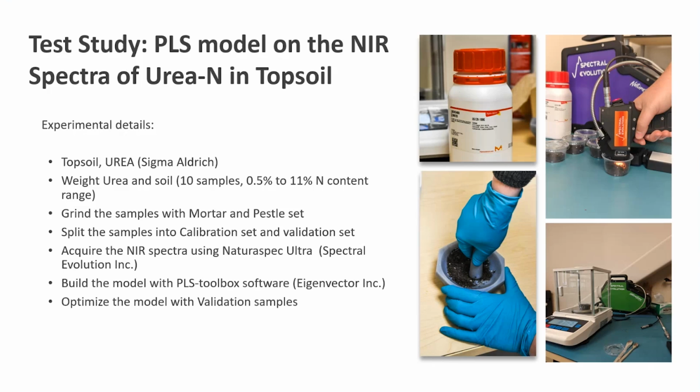So this is a rudimentary, very straightforward way of building a nitrogen model. There are some more complicated ways of doing this, but this is probably the most common way to do it. And we only used 10 samples, but for a robust analysis, you should be using about 100, or a lot more than 10 samples. And it's up to you how many samples you want to use, but the more you use, the more accurate.